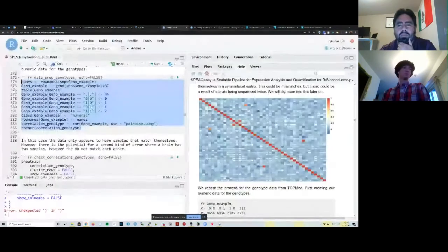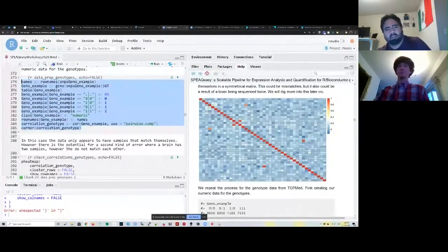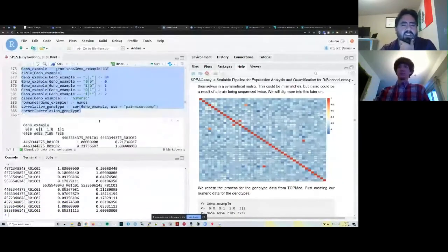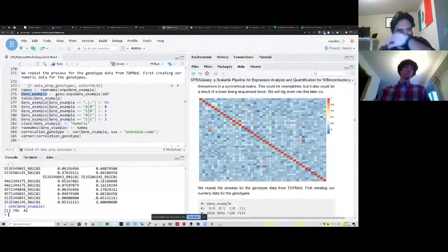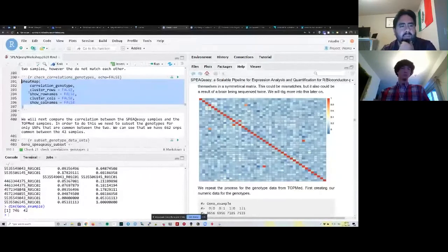There might be some. Going back here, we can repeat the same process of turning the DNA genotyping information into zeros, ones, or twos to compute a correlation matrix for the same variants, but those that are observed on the DNA genotyping side. Let me see here, what are the dimensions? So we have our 42 brains, and in this case we have 746 variants from the DNA genotyping side. With those, we can make a second heat map.